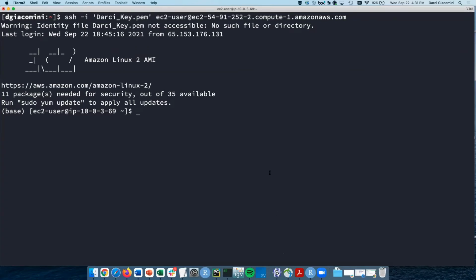Okay. So this is what we had hoped to have you guys do with us, but it turns out we can't do it. So I'll just demonstrate and you guys can follow along. This is an EC2 instance and it already has all the data loaded onto it. So if I hit this ls command to list out everything that's inside of here, you can see that there's 4 different folders. There's a miniconda, an output folder, a scripts folder, and a studies folder.